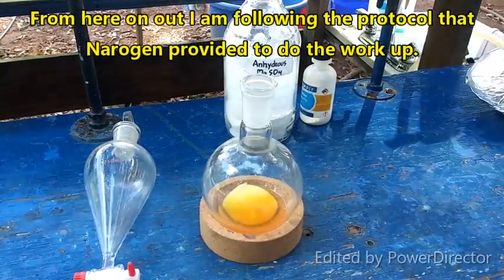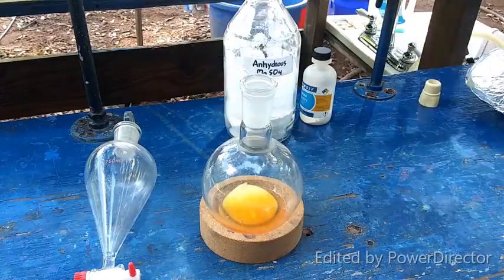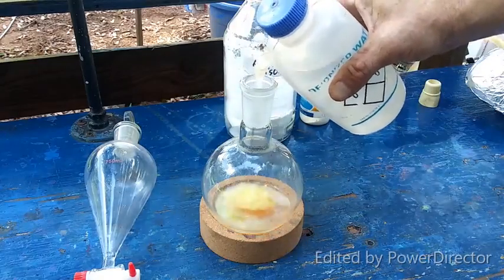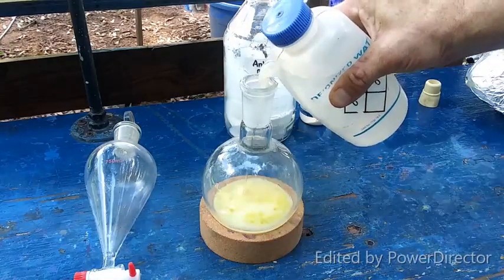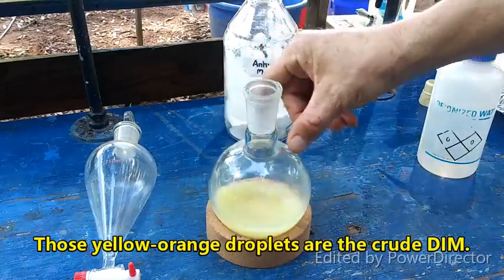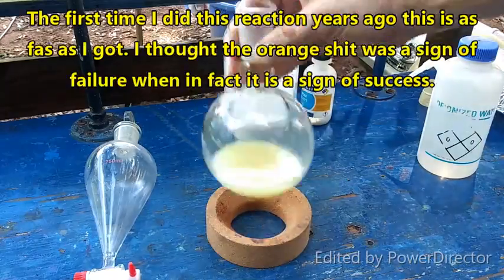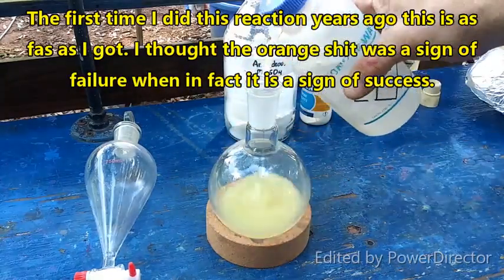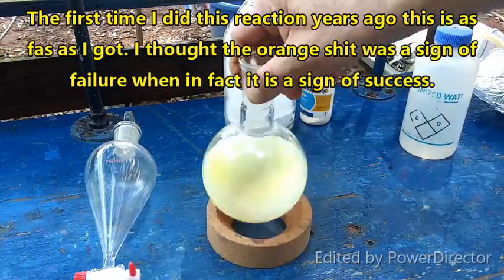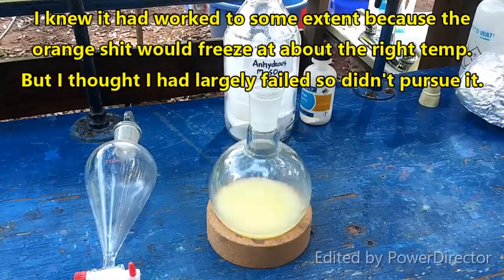Alright, got that done. Now the next step is to add water to this. I have not found anything that says how much, so we are just going to do this as good as we can. Oh, look at that, little droplets of orange stuff. Oh, that's pretty cool. What do we got down here? Oh, yes, there is orange stuff on the bottom. Alright. I hope that's a good sign. And it's even liquid, little droplets of orange liquid. How very cool. Alright, so we've got our water in there now.